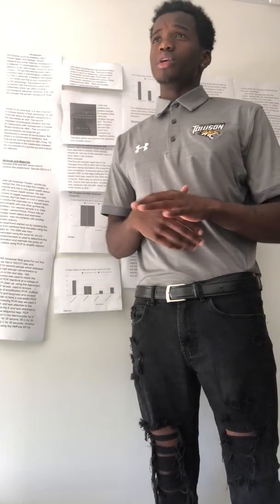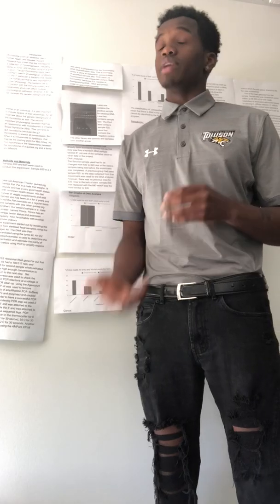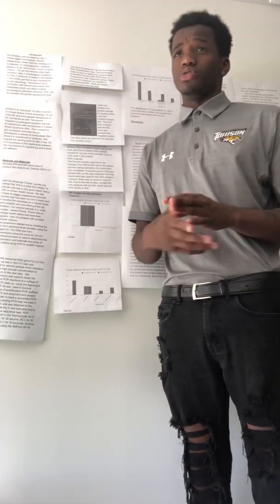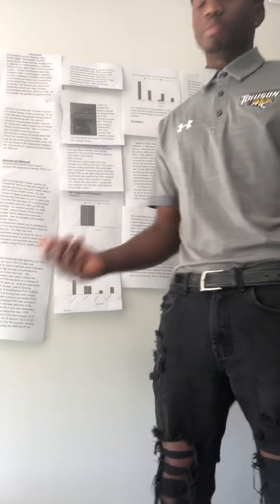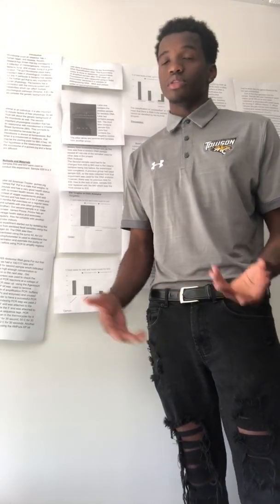After the PCR cleanup, we used the Qubit fluorimeter because it is better than the UV spectrometer. The Qubit fluorimeter is able to distinguish RNA, protein, and DNA, but the UV spectrophotometer cannot do that. So that's why we use the Qubit.